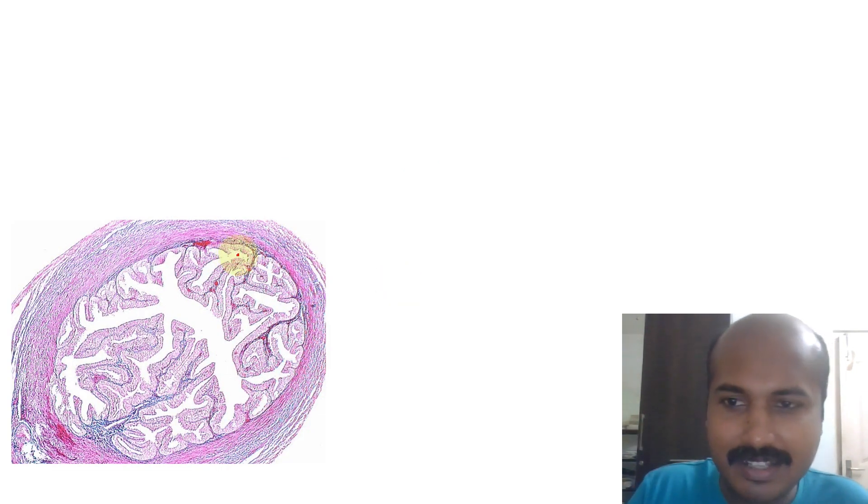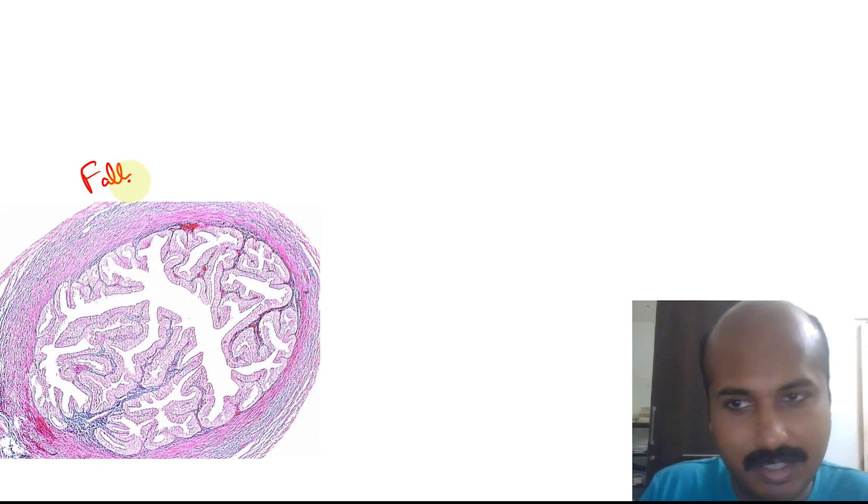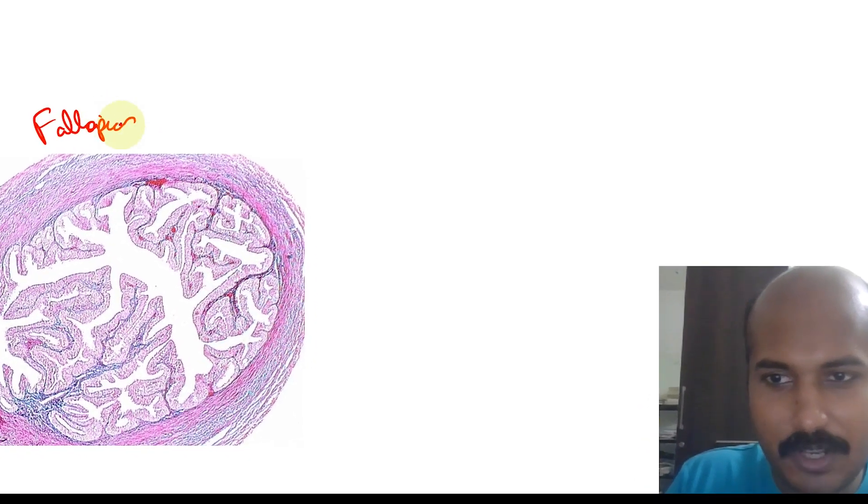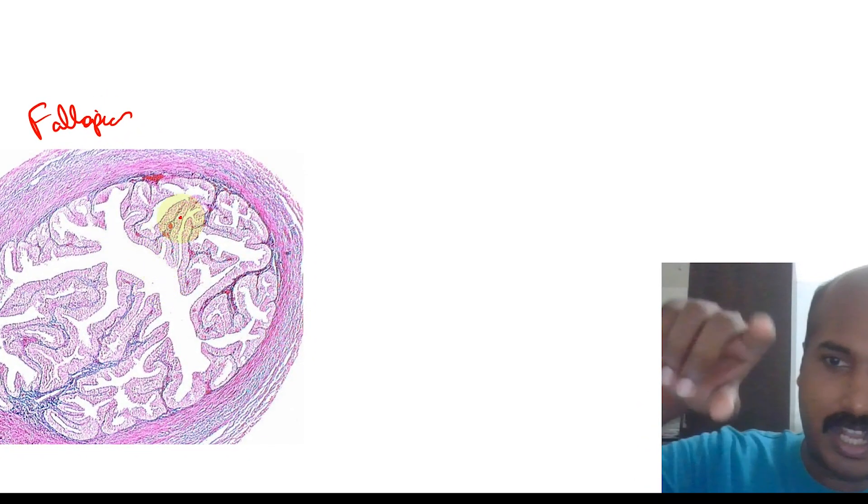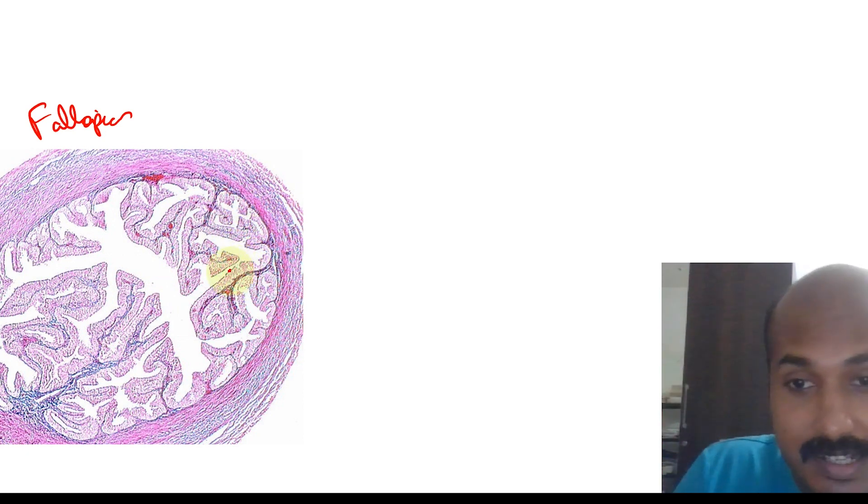To make it more clear, I've taken two representative slides. This is a slide of a fallopian tube, which you will learn in detail later. In this fallopian tube, this is the lumen, and what you're seeing here are all mucosal folds. When you learn fallopian tube later, you'll understand that this is basically epithelium.